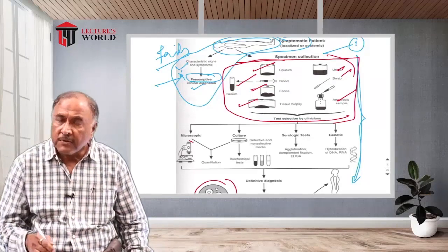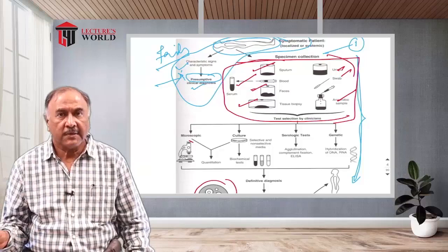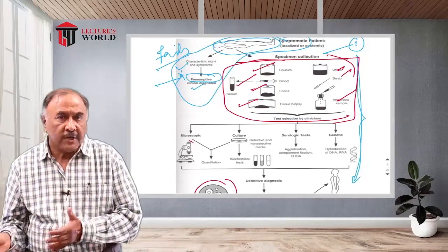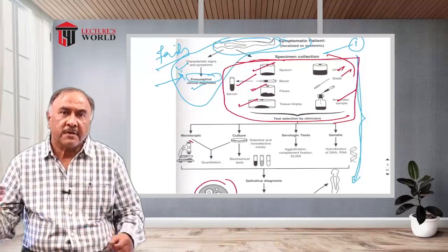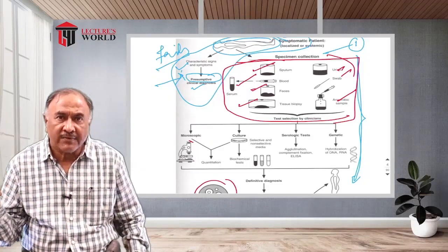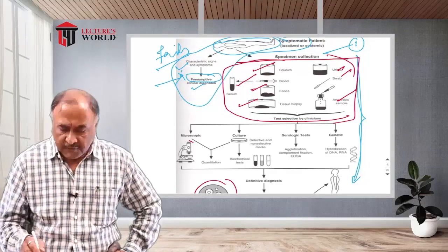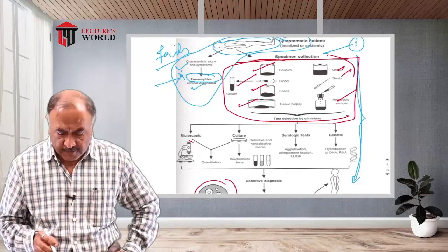Well, this is a microbiological identification. A third way or a fourth way can also be there by use of certain other tests, by studying the biochemistry of the patient, by advising certain tests like X-rays, MRIs and whatnot. Many of them are there. But this is what is followed when we want to identify a pathogen.